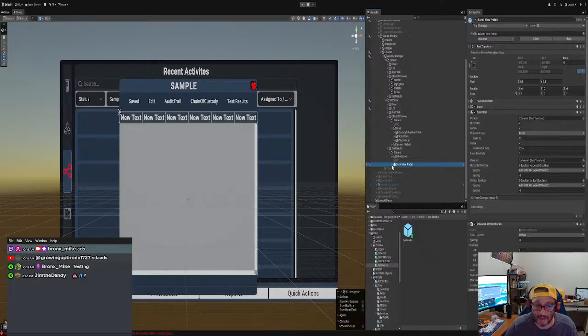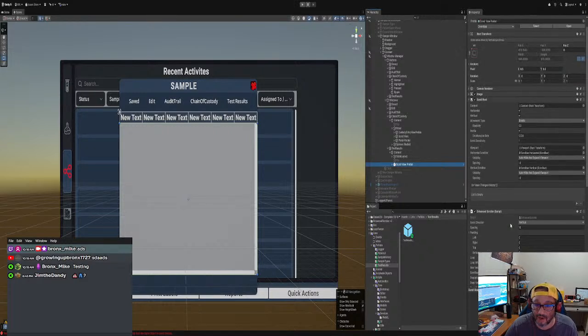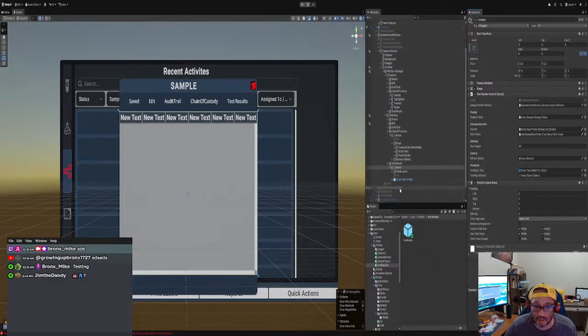So now on the prefab view, what you want to do is drag and drop that, not on the view, yeah, there we go. You want to drag and drop this on the prefab right here, right? And on your scroller you want to drag and drop the scroller right here. That's it. We don't need this. Okay, sample parent window, which is the one that we have up here, right? This is just to get the current thing, and then the current sample, right?